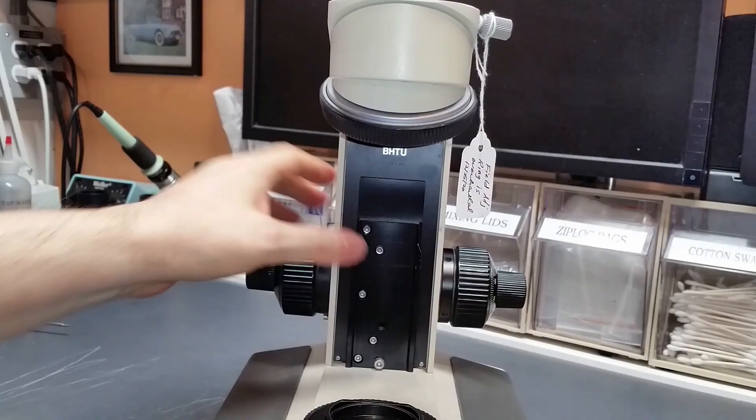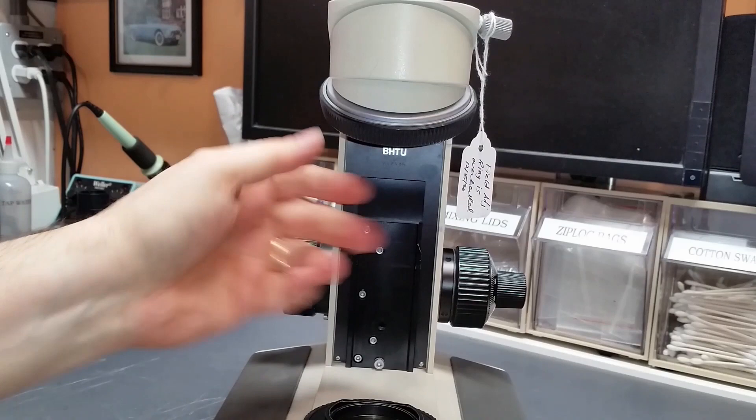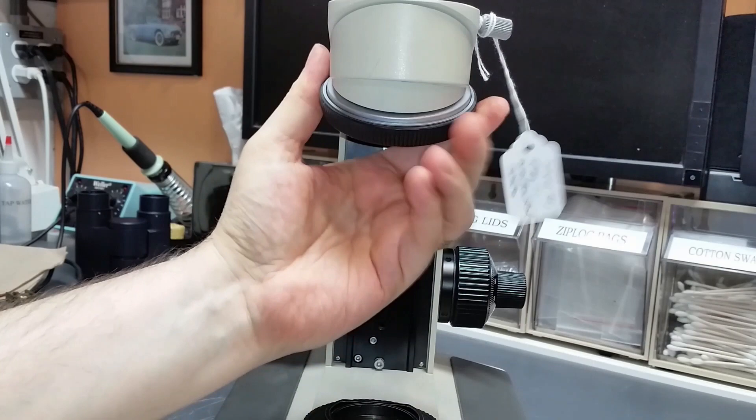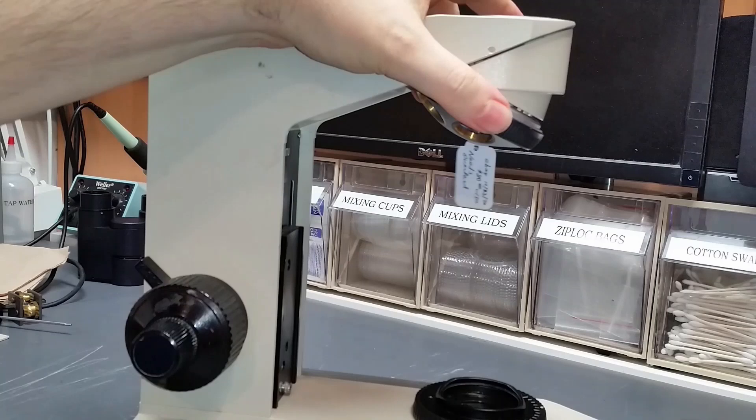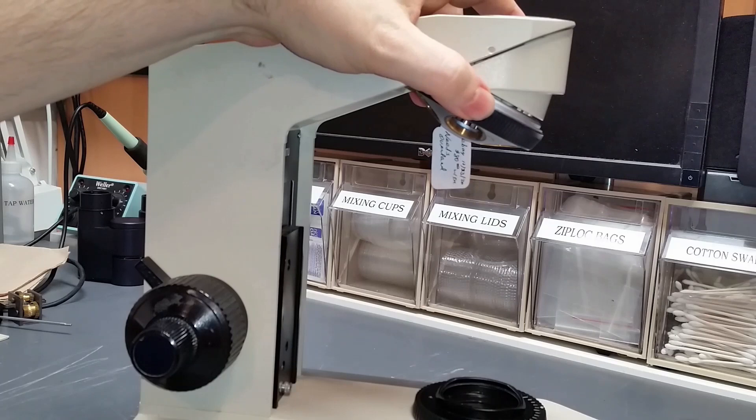I have the turret, the nose piece turret here. This is a five position BHTU reverse turret. And it's not sticky, it's not gummy, it's not stiff to turn, but it feels squeaky. It feels like the bearing balls in there are literally dry. So once again, this will come apart and be totally cleaned and put back together.